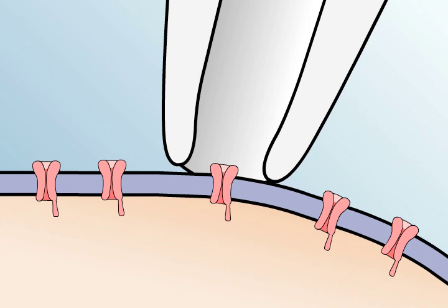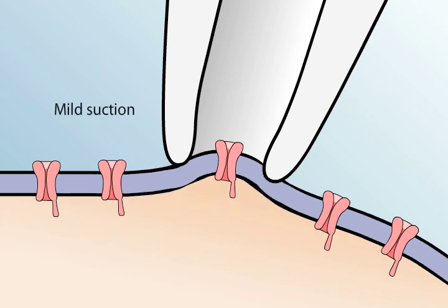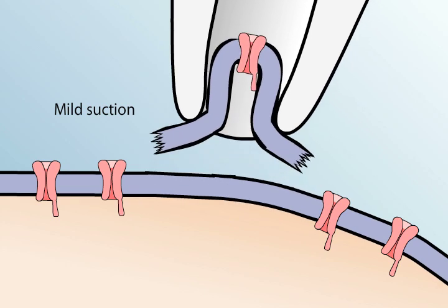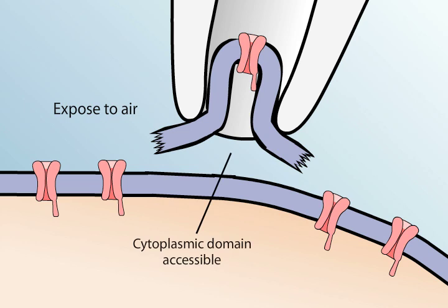the membrane and the glass pipette, small pieces of membrane can be pulled away from the cell without disrupting the seal. Simply retracting a pipette that is in the cell-attached configuration causes a small vesicle of membrane to remain attached to the pipette. By exposing the tip of the pipette to air, the vesicle opens to yield a small patch of membrane with its former intracellular surface exposed.